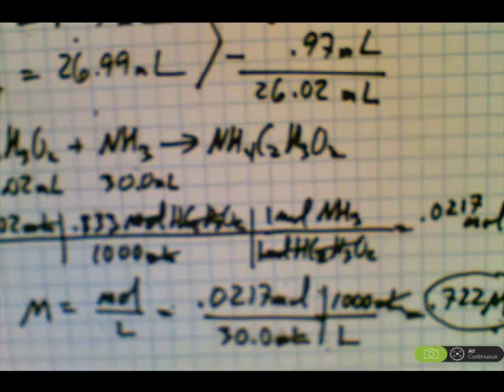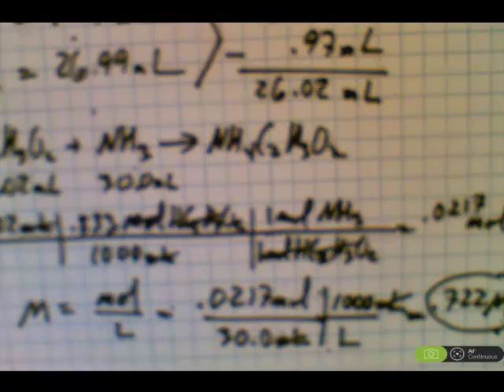There are different kinds of titration, but this acid base is a pretty good way to get started and become familiar with how it works.